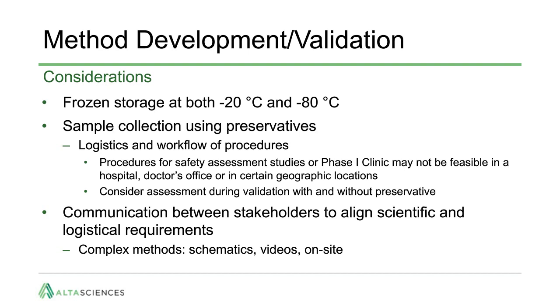Procedures and preservatives selected for sample collection at a test facility or phase 1 clinic may not be appropriate for a hospital, doctor's office, or certain geographic locations. For sample collections requiring preservatives, the workflow and logistics should be considered. Including validation assessments with and without preservative for future impact assessments is suggested. There should always be communication between stakeholders to align scientific and logistical requirements. For complex or novel sample collection procedures, providing schematics, video training clips, or even on-site training is helpful.